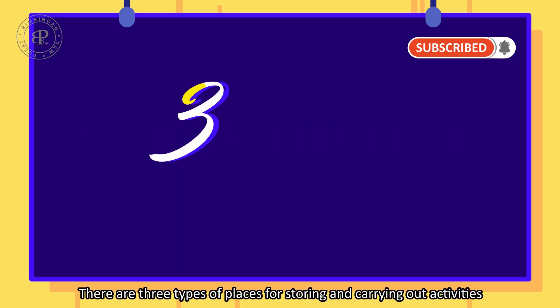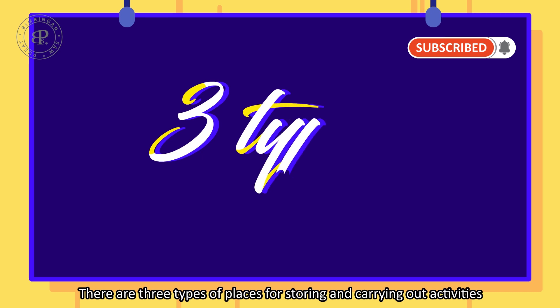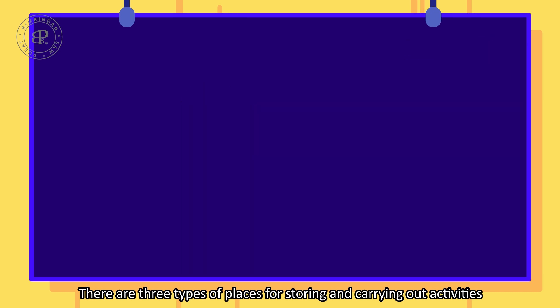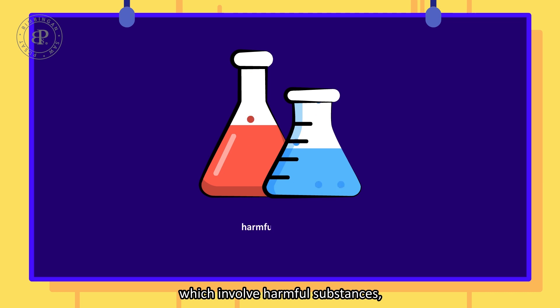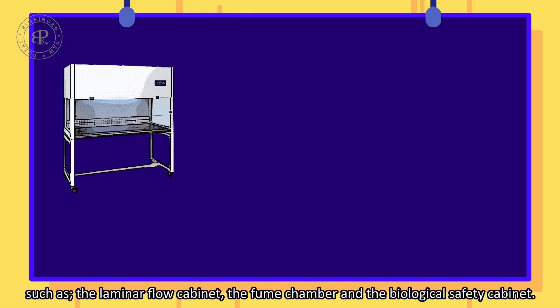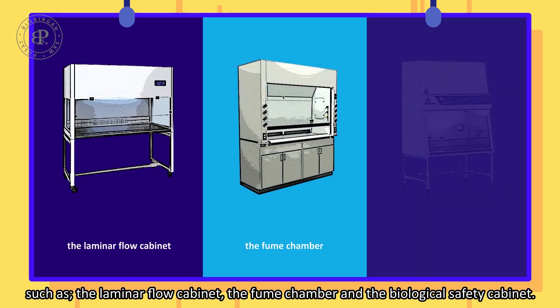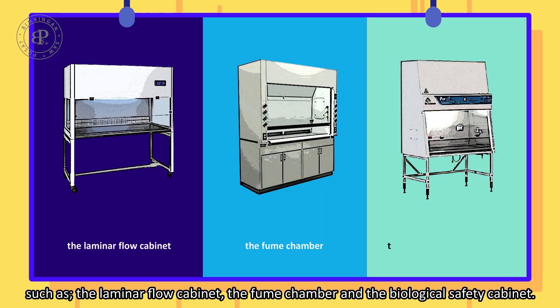There are three types of places for storing and carrying out activities which involve harmful substances: the laminar flow cabinet, the fume chamber, and a biological safety cabinet.